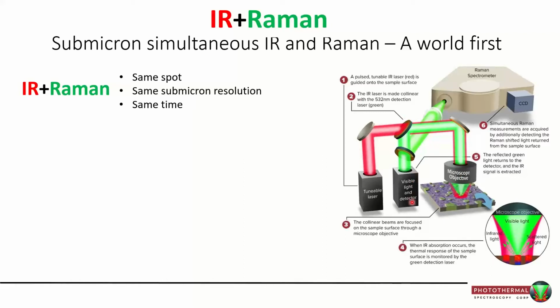So this is another important point that I sometimes forget to mention. Even though we excite in the infrared, once we've excited the sample, everything downstream from that happens in the visible. So all of the infrared information is collected with a room temperature, high sensitivity silicon detector, photodiode. Now, that's all the reflected green light.